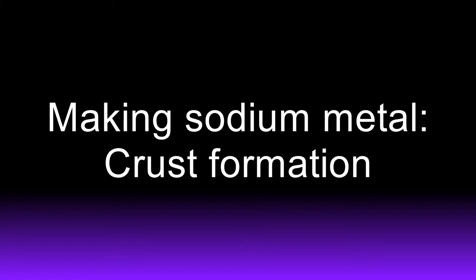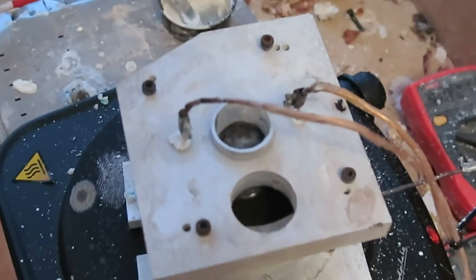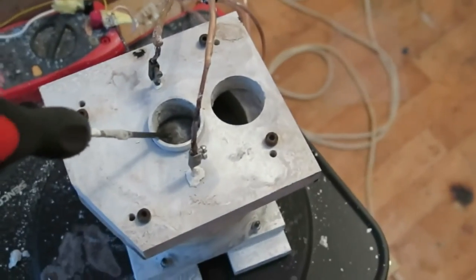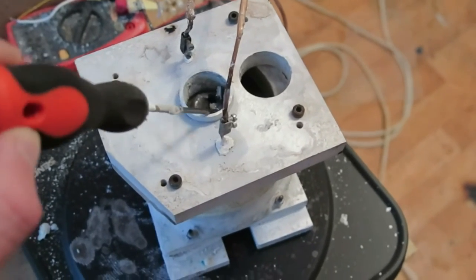It is very important that the salt in the collection tube remains in a liquid state. If the salt solidifies, an explosion or molten salt leak may occur. If the salt solidifies, you must break the crust, wait until the hydrogen gas escapes, and reheat the salt and lid.